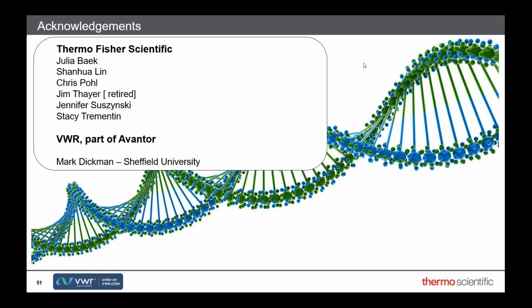The other option is to cut that big thing down into smaller pieces. So actually use restriction endonucleases, cut the beastie down and look at the smaller ones, either separately or together.